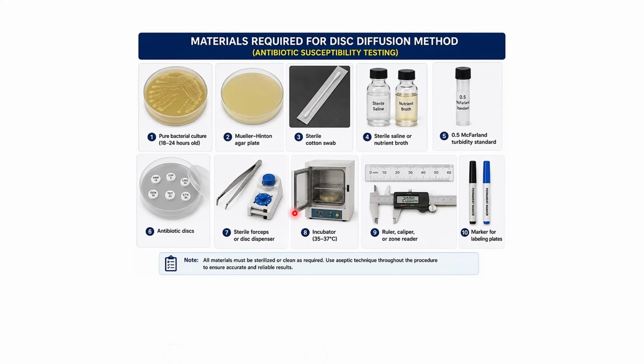And one important thing we must note is that all materials must be sterilized or clean, and we must use aseptic techniques throughout the procedure to ensure accurate and reliable results.